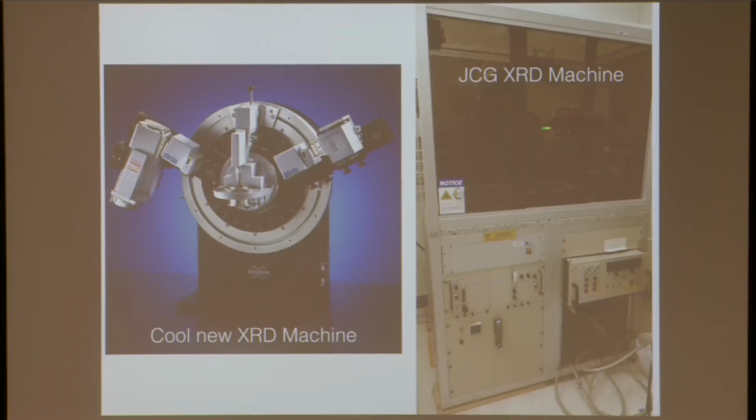But you see, the point is, they do the same thing. We don't need fancy equipment at MIT. No, we can. It's the ideas that matter that you're putting into this thing. But that's kind of cool still. I like the way that looks. Same thing, right? Source, sample, detector. It's hard to see, but source, sample, detector from the 60s-ish.